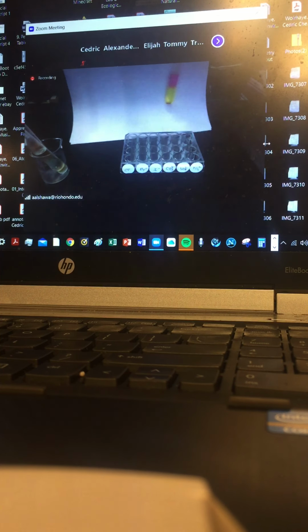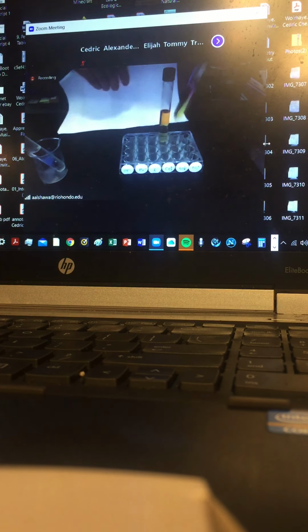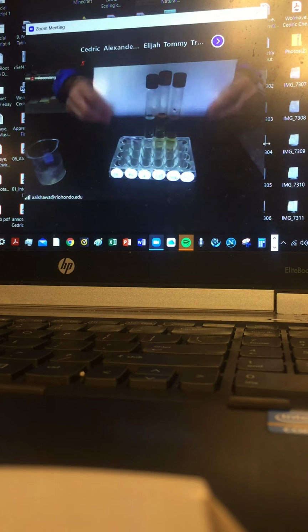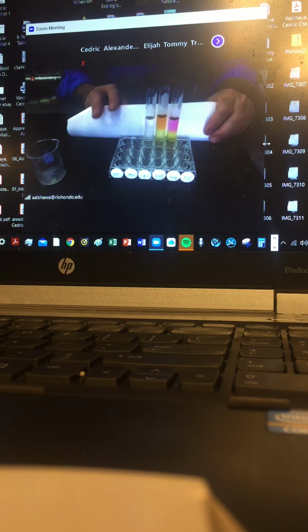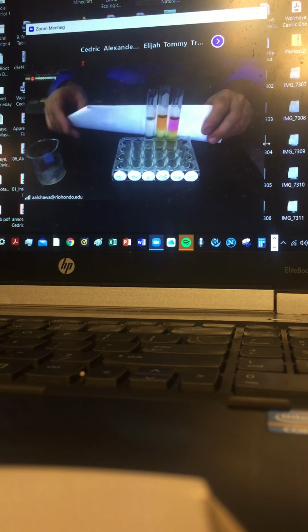So is the iodine compared to these are much better. So this is a much better comparison side by side. We call these test tubes control test tubes. Can you see them? Control means every time you want to figure out what's happening, you go back to them and reference the colors in them. So these are the control, and keep them all day long as a backup to check on the rest of the other activities.